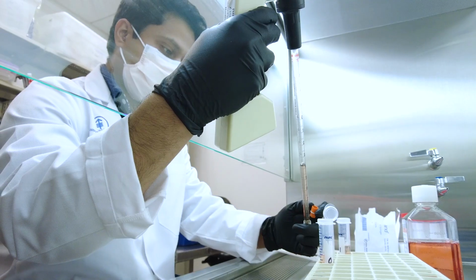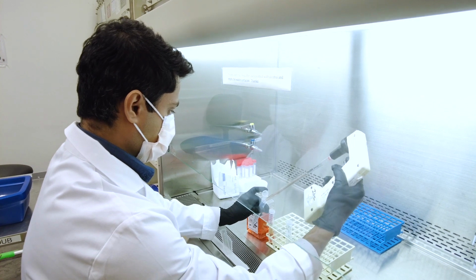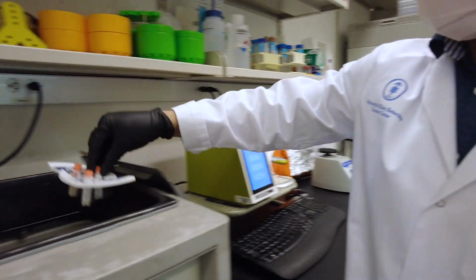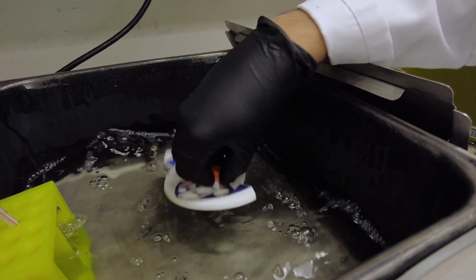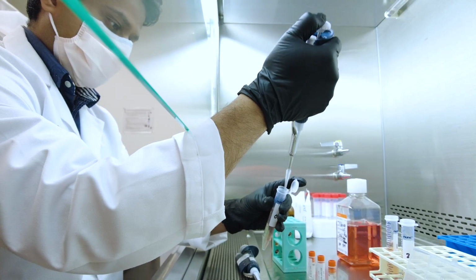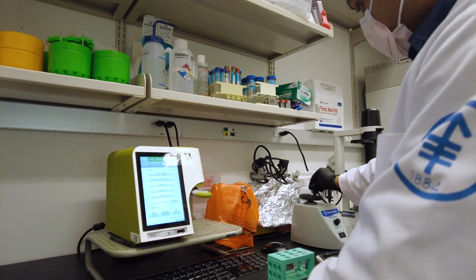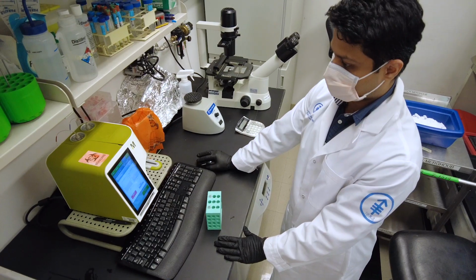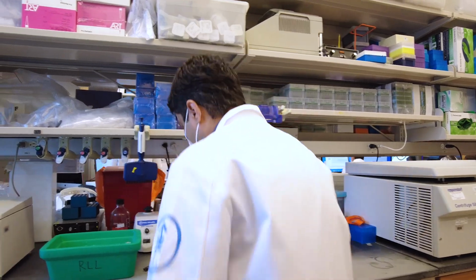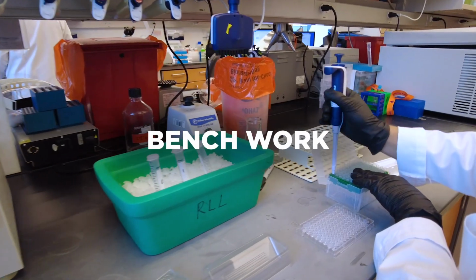Samples are typically batch analyzed in order to minimize the inter-assay variability across experimental runs. First, the PBMC samples need to be thawed, washed again, and counted. This is done to determine what the live cell recovery is after thawing the cells and calculate how much sample there is to work with in the assay. Then the samples are taken to the bench and the lab member will set up the experiment.